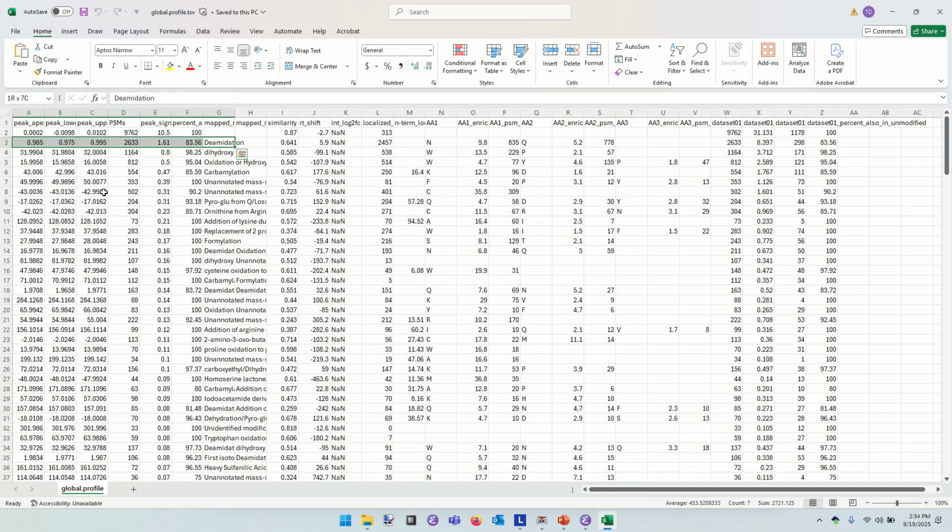But what if the problem here is not that we chose the wrong isotope from the MS scan, but rather that at some point in the database sequence, we need to make a little addition of 1 mass unit in order to make this sequence match the fragment ions. That's different, isn't it? So in this case, is there a reason why the chemistry of peptides being in the environment for a very long time could lead to a gain of 1 Dalton?